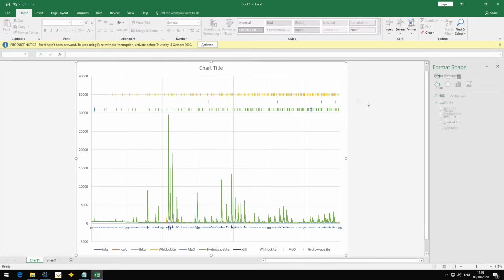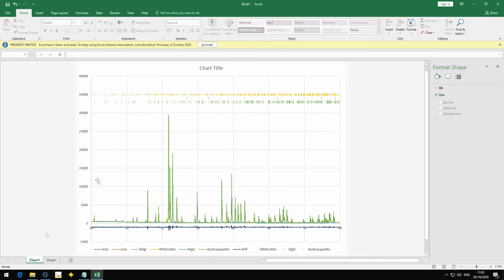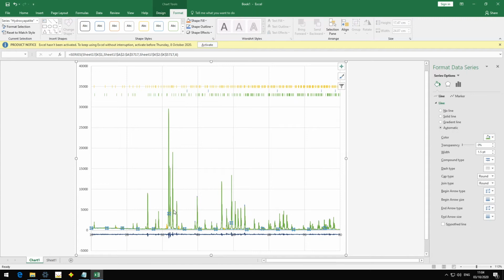And now maybe we could optimize the vertical position a little bit, move the bottom one up a bit and also reduce the spacing. Let's try this. That looks quite nice. Now to further improve this chart, we can, for example, remove the title. I also prefer to have thinner lines. So they look quite bold to me.